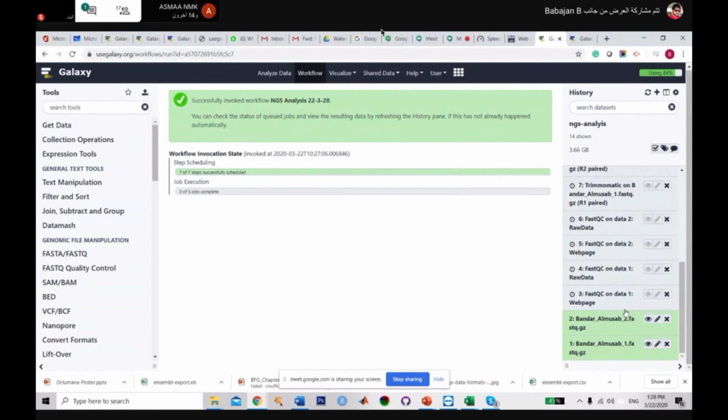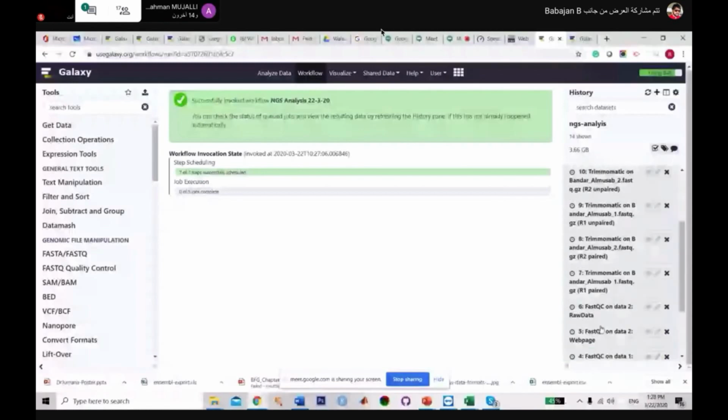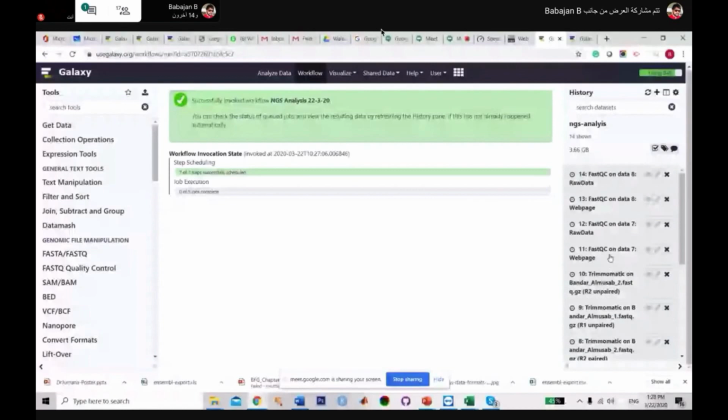We are going to look more at this FastQC web page. First we need to check the quality. Once the quality is okay, then we can go for the alignment. But as I told you, if you're not happy with the quality, it is always better to go with the Trimmomatic approach. If you cut, you have to check the quality of your sequence again, to verify whether it really removed that undesired, error region or not, by using this command.